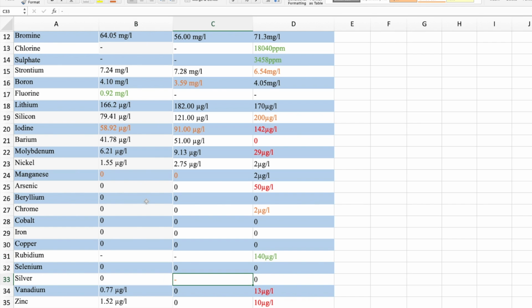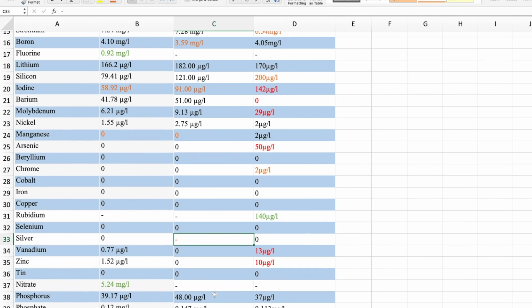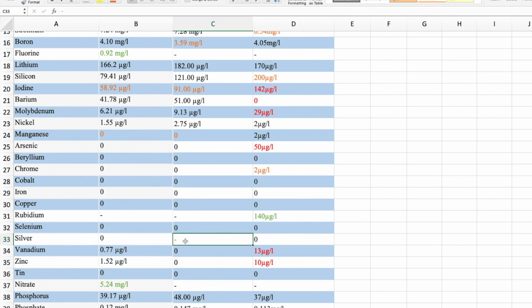Silver is not tested by ATI, but I don't know how important it is for Triton. I'm not sure how important it is. I've given them a warning. You can take a point off if you want, but I'm going with the warning. Not detected in the other two.